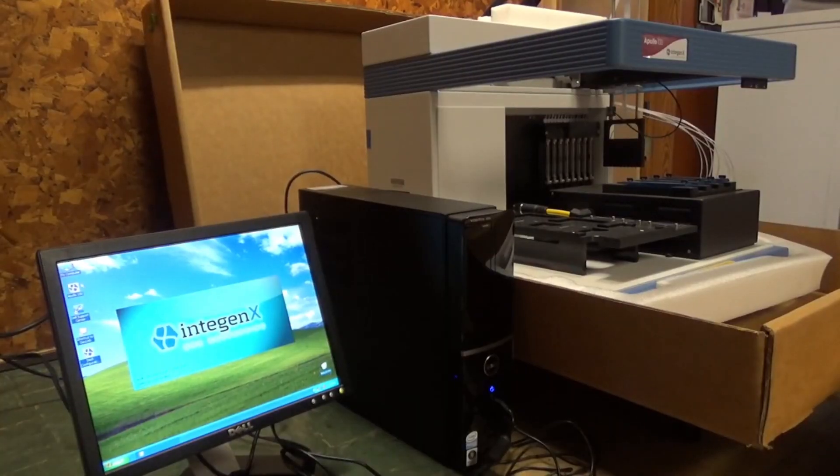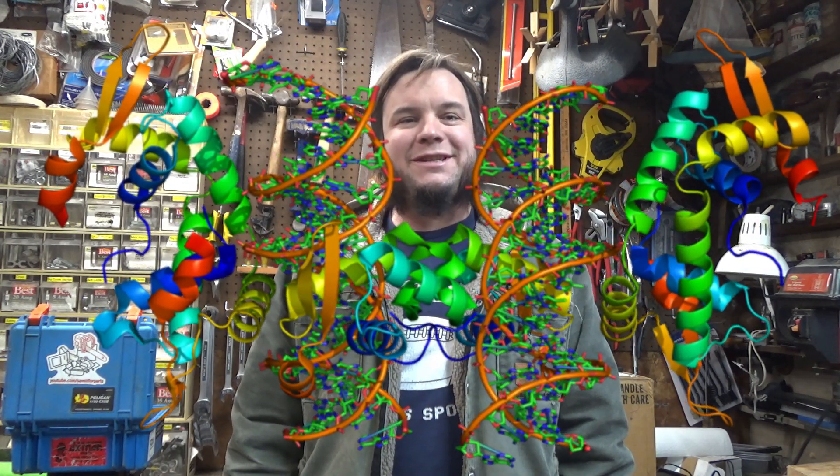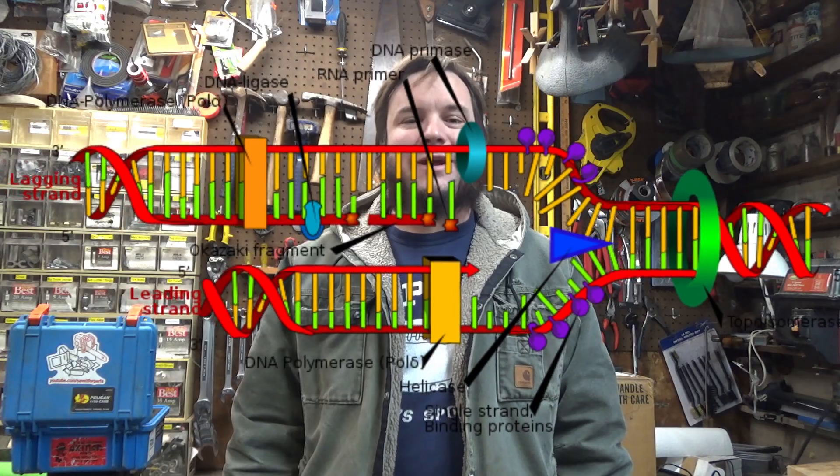Hi, and welcome back to the Saved for Parts channel. Last summer, I bought a DNA sequencer at a surplus auction for under $100. Now at the time, this seemed like a really cool gadget, but what can we actually do with it?